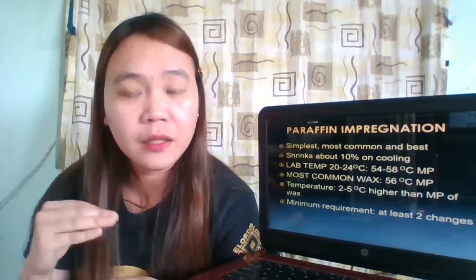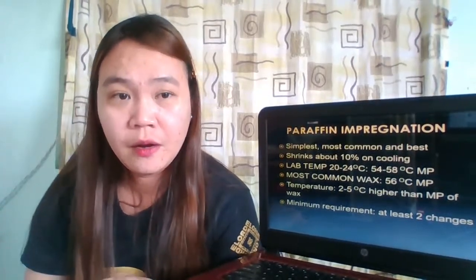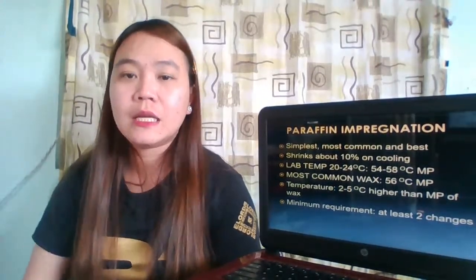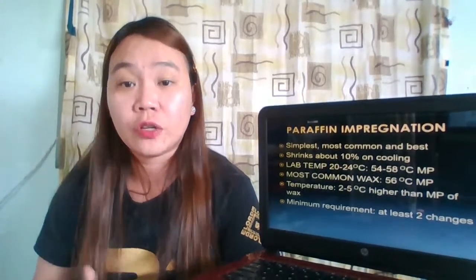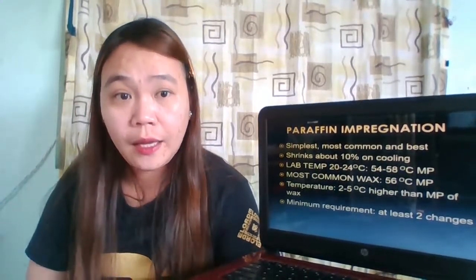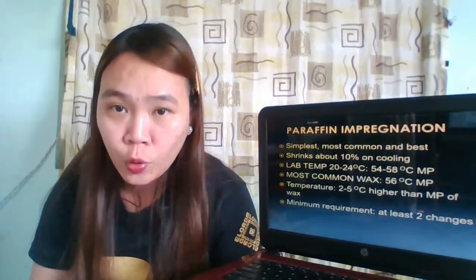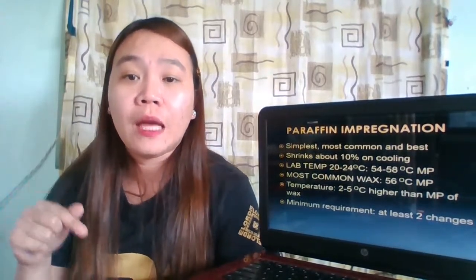The harder the wax, the thinner your sections are. I repeat: the higher the melting point, the harder the wax, the thinner your sections are. Please do not forget this very important rule for the reagents that we use for impregnation and embedding.